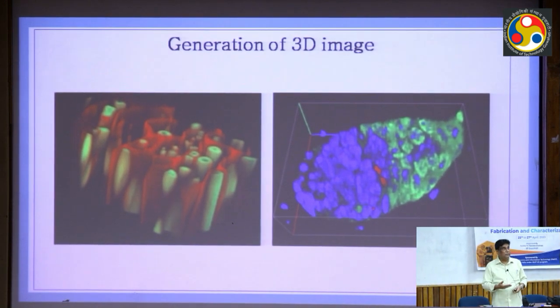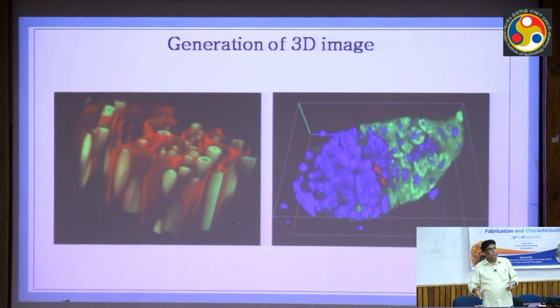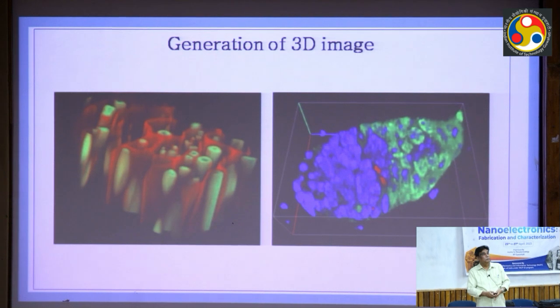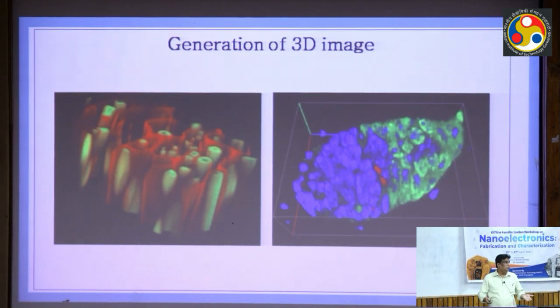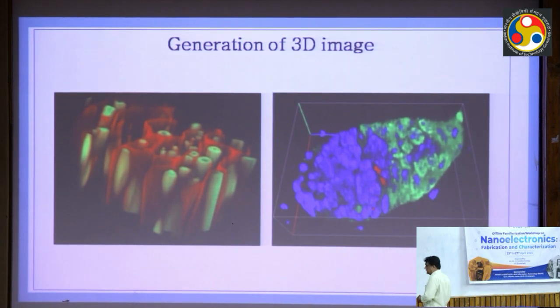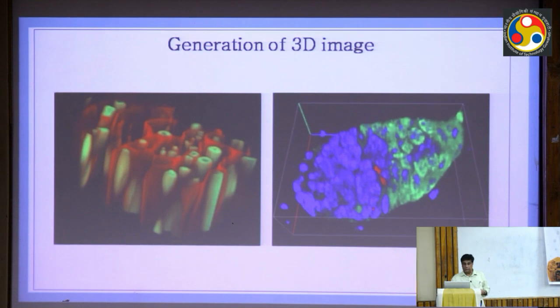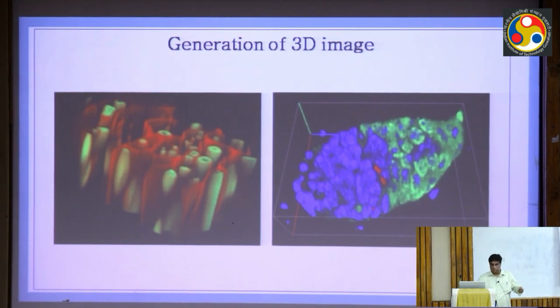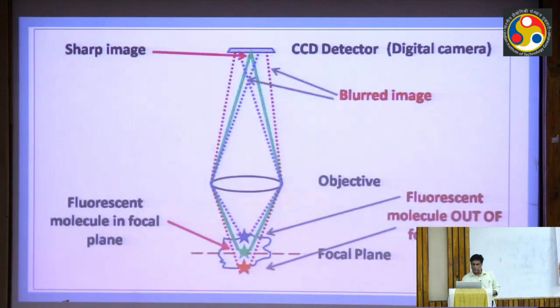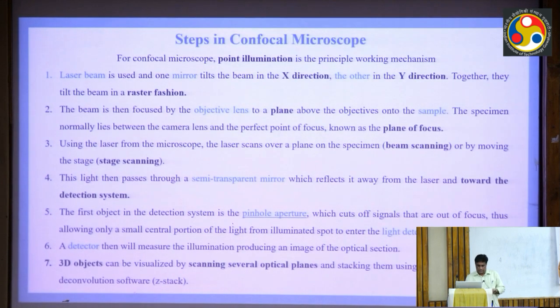That depends upon that. The confocal microscope, I am talking about the basic microscope of the confocal. There are different types of confocal. Super resolution microscope is also part of that. So that actually gets better images by the better camera and other techniques also, and then there are two photons also. We are not including this because that's not part of your workshop.